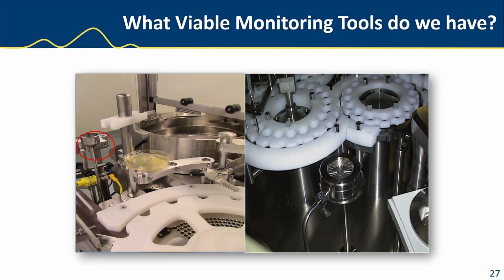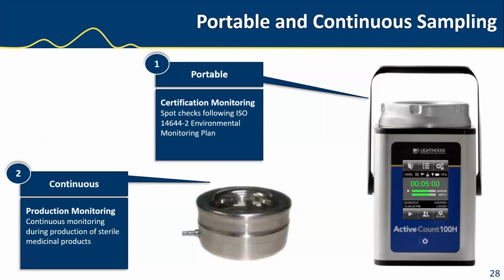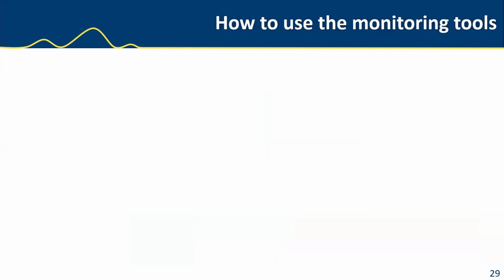and ensuring that that environment is an ISO 5 grade A environment. Again, looking at the types of instruments, you do have the portable or continuous sampling. The portable units can be brought in and used effectively, or you could have a continuous system that's set up to a continuous vacuum, connected to software. The operator can start and stop remotely or locally, and add or replace the media once it's expired. And this is what these devices look like.